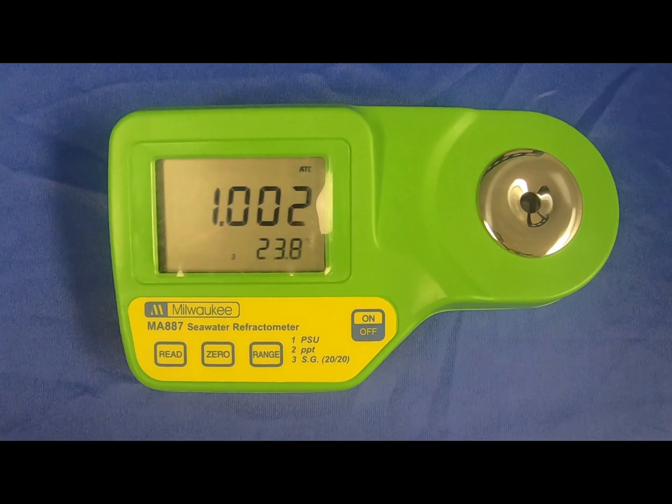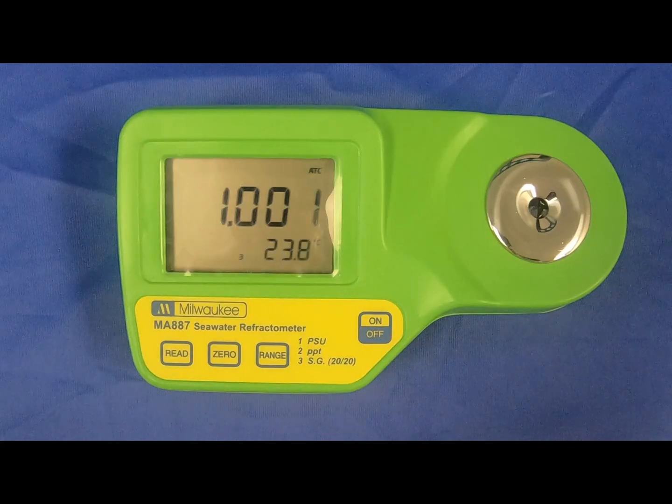After testing your sample with the MA-887, always be sure to completely dry the sample well — there may be salt residue left on it. A good way to test this is to place distilled water in the sample well and hit the read button. If it reads anything greater than 1.000, that indicates salt is on the lens. To clean this, flush several times with distilled water. If it still reads greater than 1.000, place Windex in the sample well, let it sit for a few minutes, go over it thoroughly with a Q-tip, then flush several times again with distilled water before re-zeroing the unit.